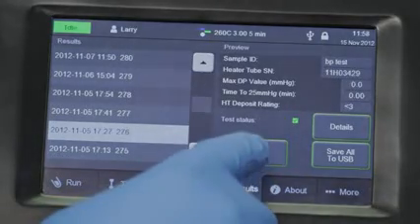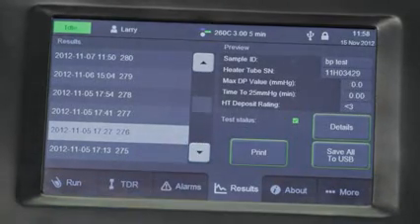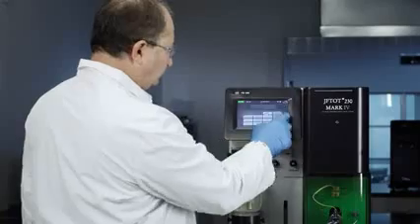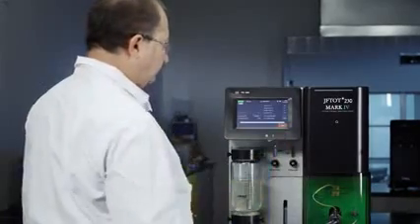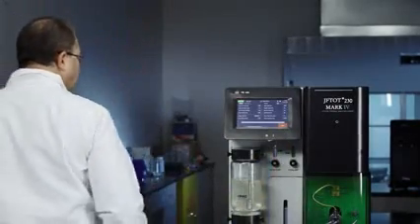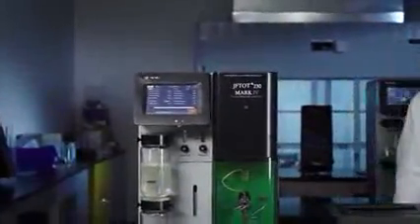In addition to being safer, smaller and simpler, the JFTOT 4 automates activities that have traditionally been time intensive, like pump priming, flow monitoring, and sample aeration.